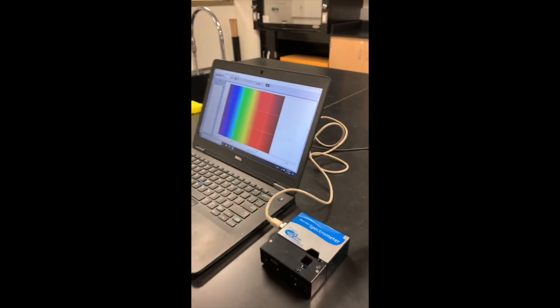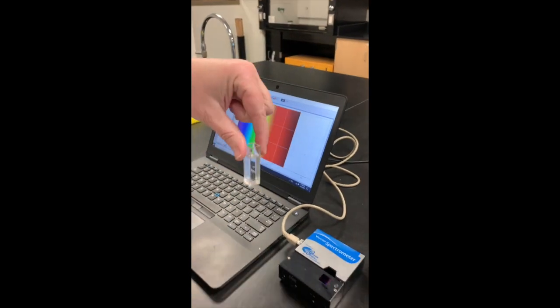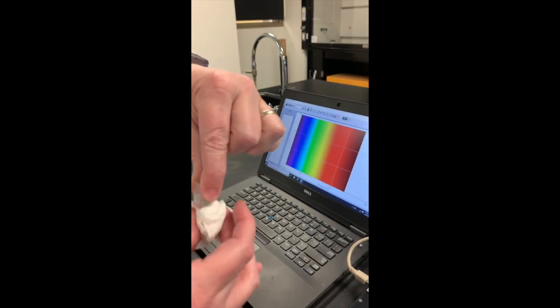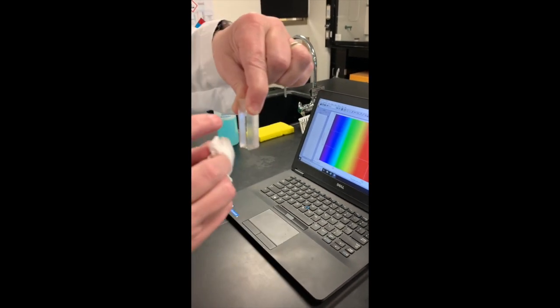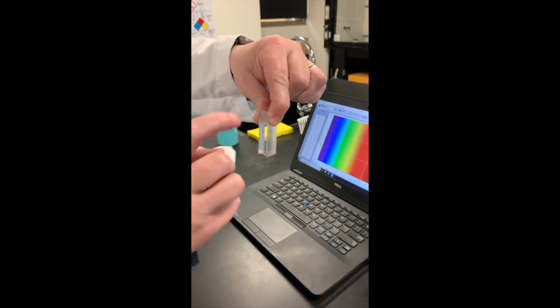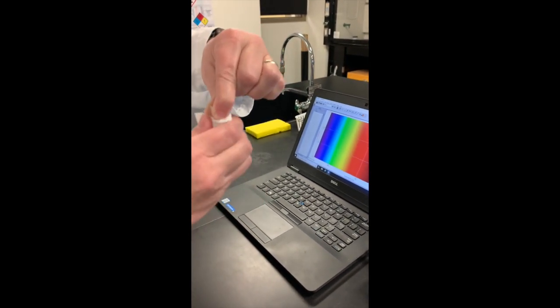Okay. So we have our setup. This is a spectrometer right here. And we use a cuvette. Now on cuvettes, they have a rough side and a clear side. You always want to make sure the clear side is facing the spectrometer, and you want to try to make sure there's no air bubbles in it. And so right now what I have is just distilled water in here. And this is our blank. Okay. It's being very ornery with the air bubbles.